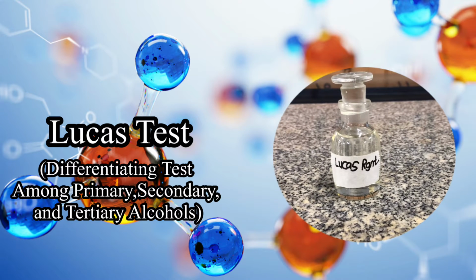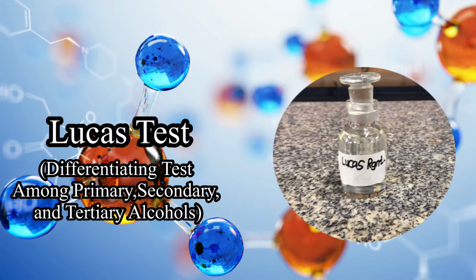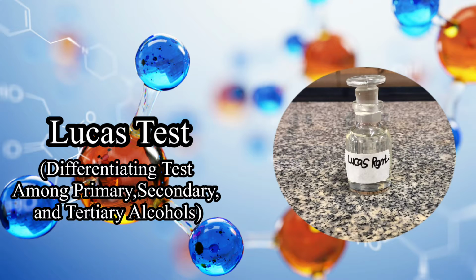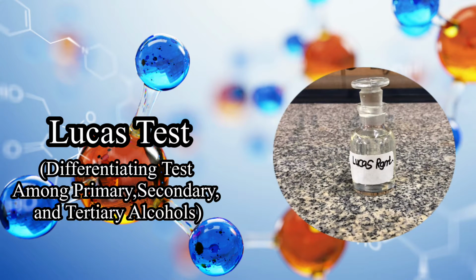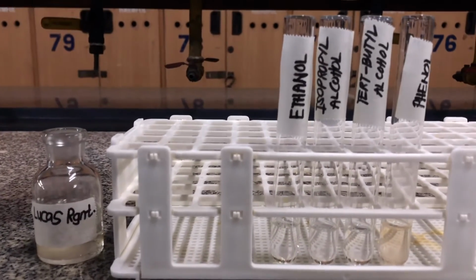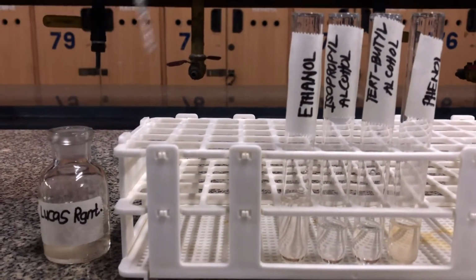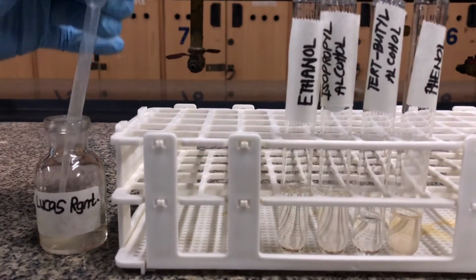This is evidenced by the formation of a cloudy layer after the reaction. The speed of the reaction is what differentiates the different types of alcohol, wherein the tertiary alcohol reacts the fastest and the primary alcohol reacts the slowest. The Lucas test is conducted by adding 1 ml of the Lucas reagent into the test tubes containing already 1 ml of each of the representative alcohol and phenol.